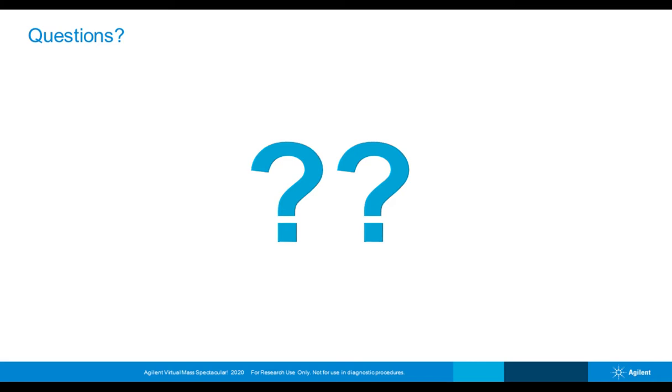Yeah, I would say that we often get this question a lot since it wasn't asked. We often get the question of when is this new sample prep method going to be available and how do we get it? And we would just say that we made a lot of progress in developing this method, but we currently do not have plans to release it as a product. But for those labs interested in more details of the manual method and the automated on the Bravo, we'd really be happy to connect with you directly.